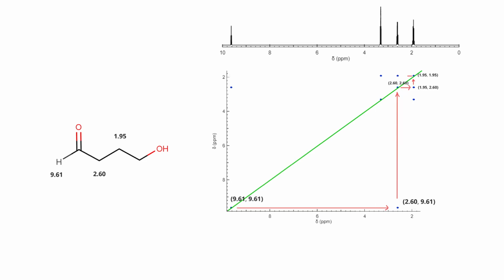But we can see another cross peak at 3.3 ppm. This must belong to the last methylene group, which is next to the oxygen atom, as actually we would expect based on the chemical shift. So you can see how we can jump through the chain based on the COSY experiment and how we can assign the peaks to the structure based on this experiment.